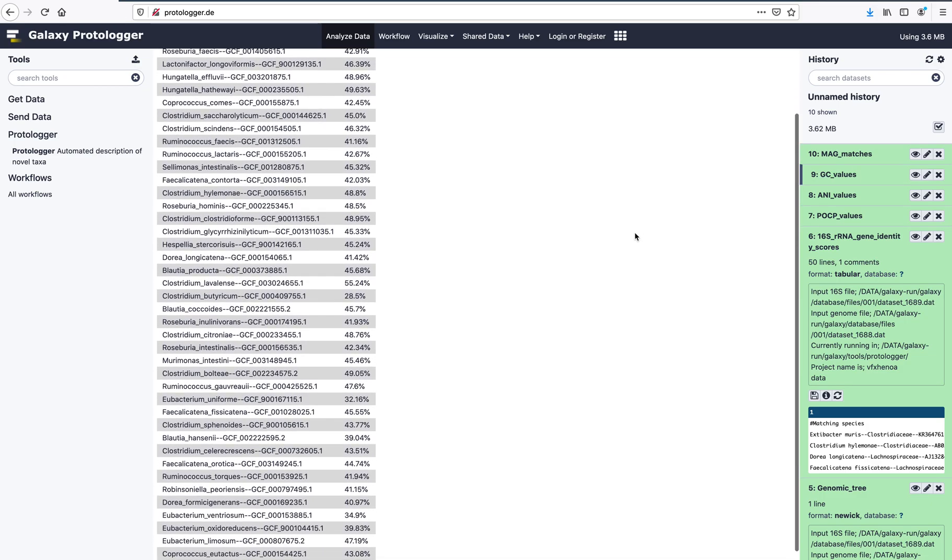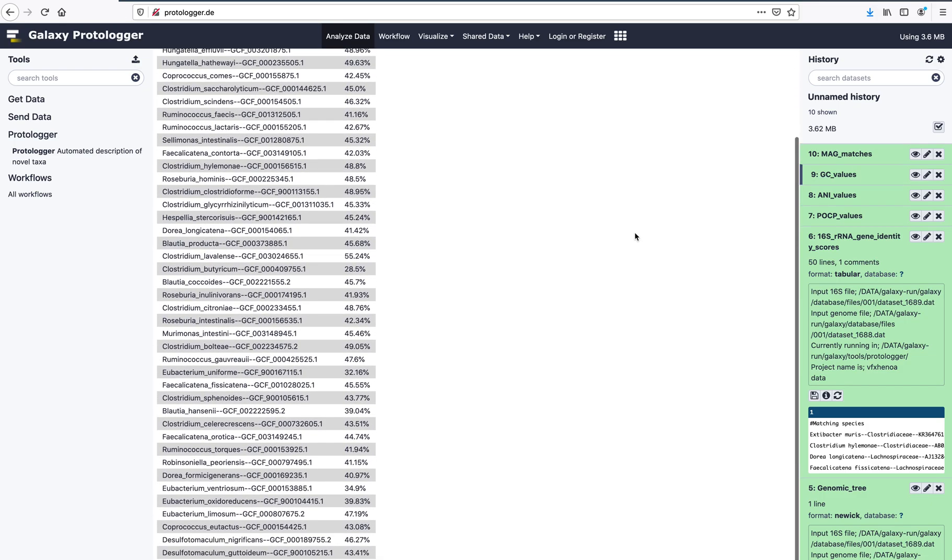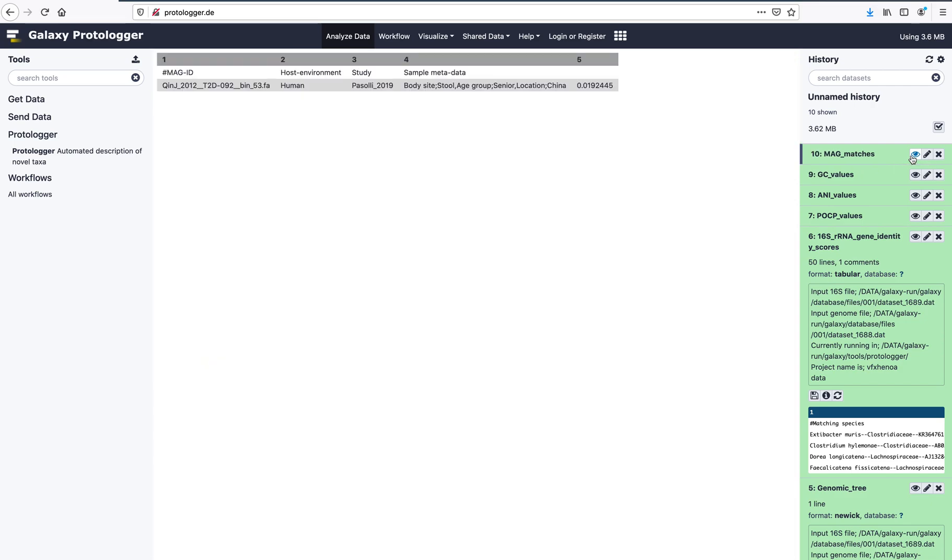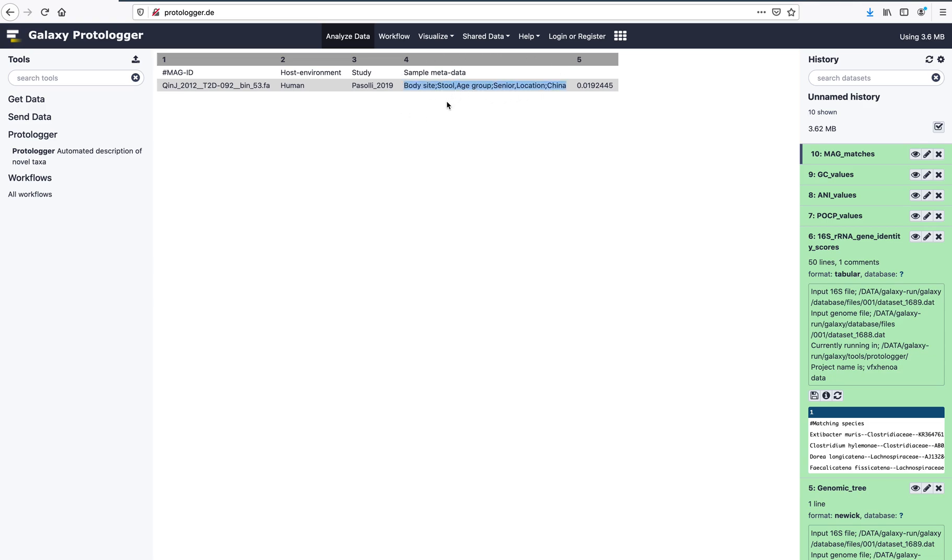The final output is a MAG matches file. This provides information about the origins of the MAGs matching the input genome. As mentioned before, in this example, a single MAG matched the input genome. The matching MAG originates from the human microbiome and is provided by Pasolli et al., 2019. The metadata column highlights that it was a stool sample from a senior Chinese individual.